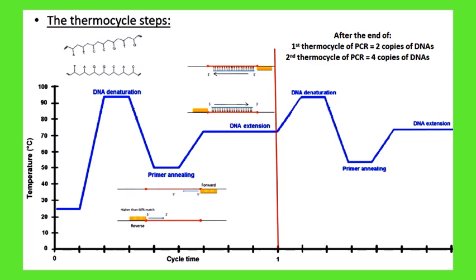So now we obtained copies of the target or desired gene or sequence we determined before.